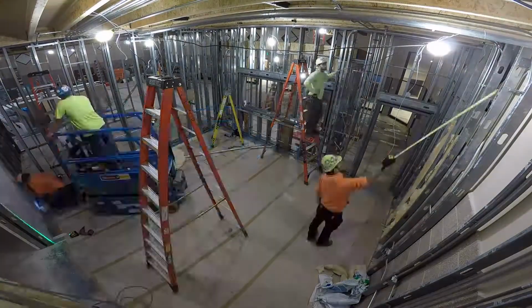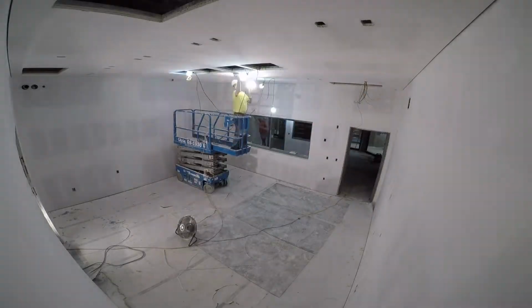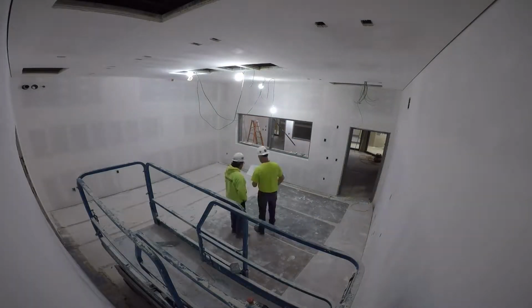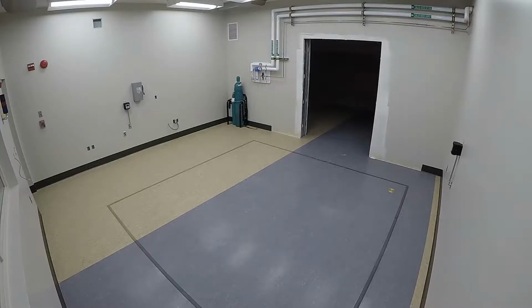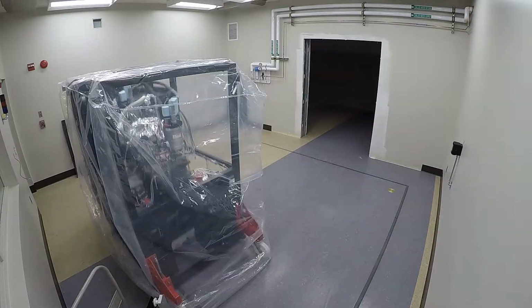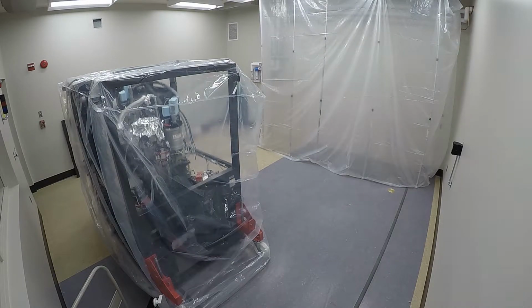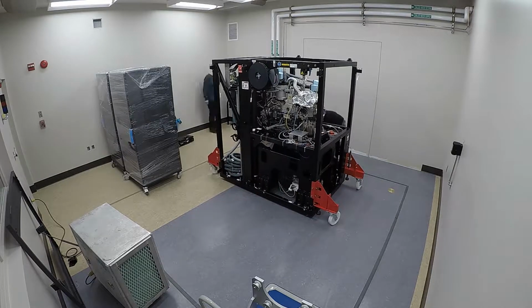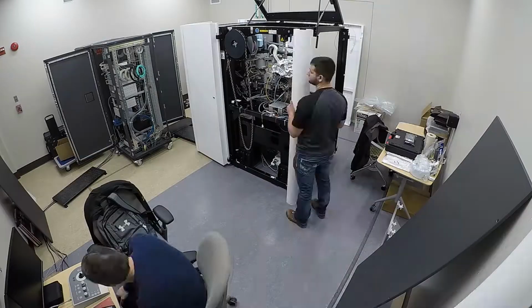In anticipation of this microscope, we had to build a home for it, and that involved a lot of work by a lot of people, a lot of electrical engineers, mechanical engineers, people really designing this space to suit the needs of this microscope. Because it's highly sensitive, we needed to worry about things like proper humidity control, vibration, acoustics, and electromagnetic fields, which means the room that it's in is very specialized towards high-end instrumentation.